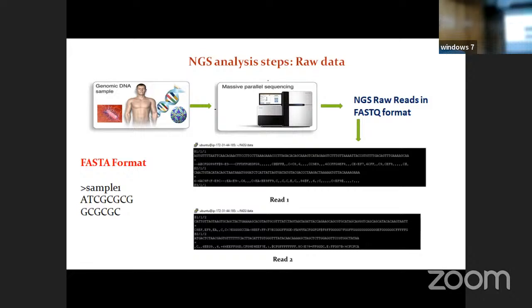When you take data from multiple organs, you might find that in one organ 2 isoforms are expressed, in another 3 isoforms are expressed. Quantity might be different. When you are identifying that a gene is dysregulated, it is quite important to know which isoform is dysregulated.